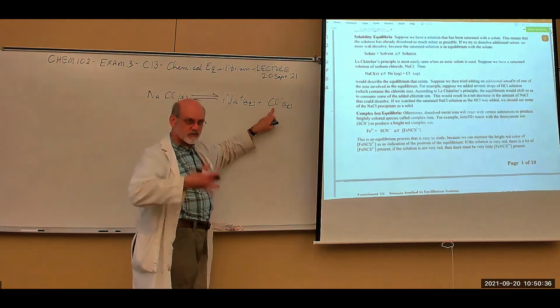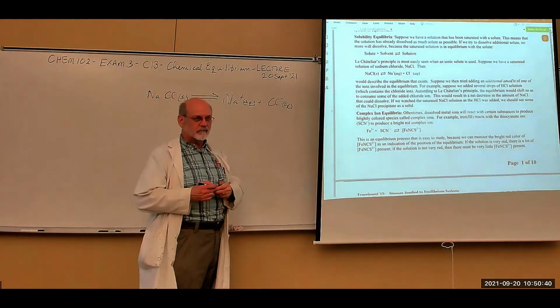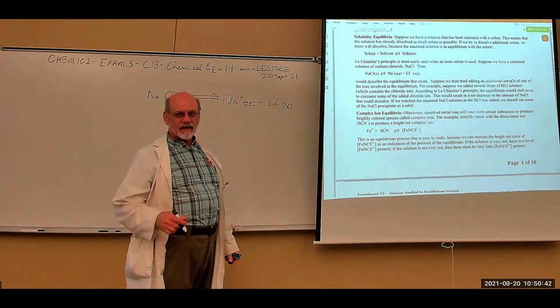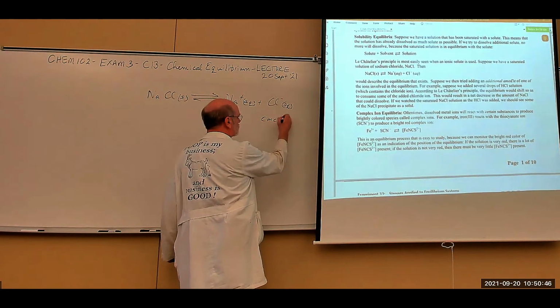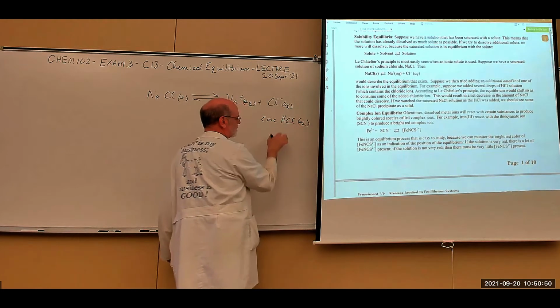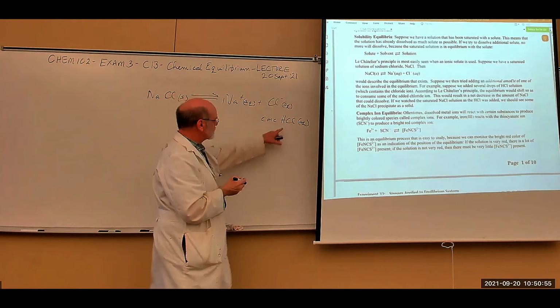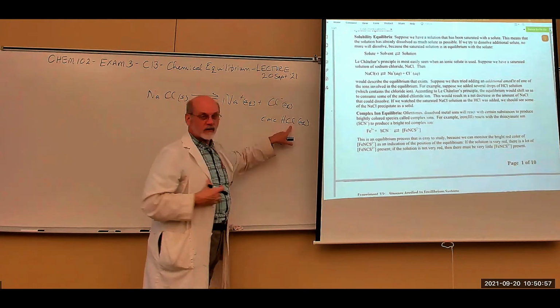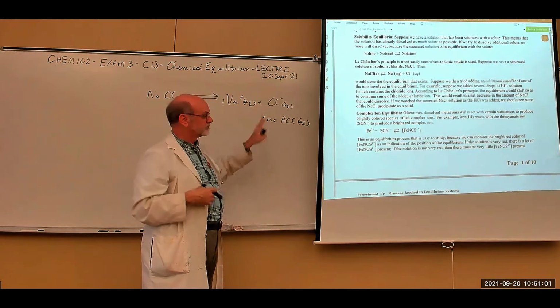That's a change in concentration. So how would I do that? How about concentrated hydrochloric acid? That has hydrogen ions and chloride ions, but the hydrogen ions are not part of this reaction, so I'm really only adding chloride to this equilibrium. That's how we do it.